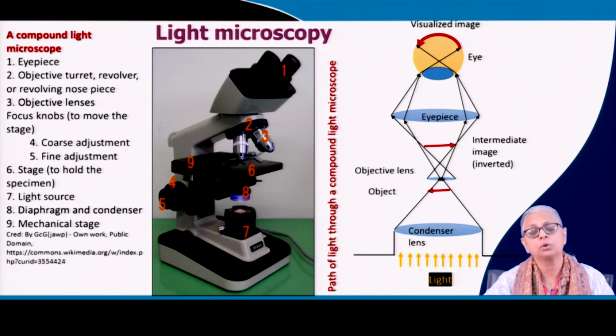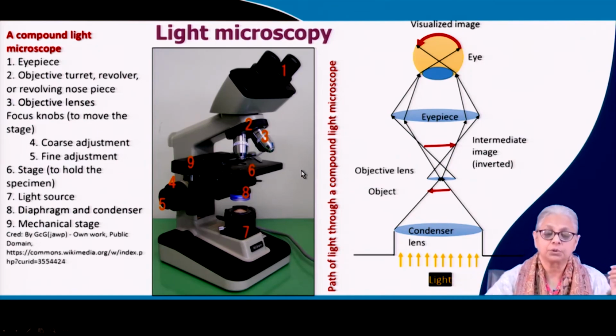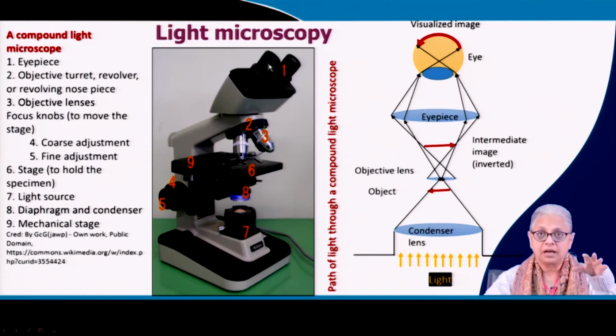And I'll add one more point over here. Another major advancement, I would say, especially from my time, more than 30 years ago when I was working with microscopes, I found that it was very difficult to count bacteria under the microscope. So today we have the ability to put in a PC and a camera. Instead of your eyes, the eye is the camera.